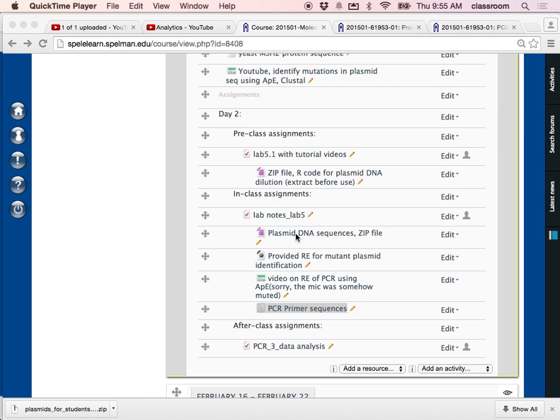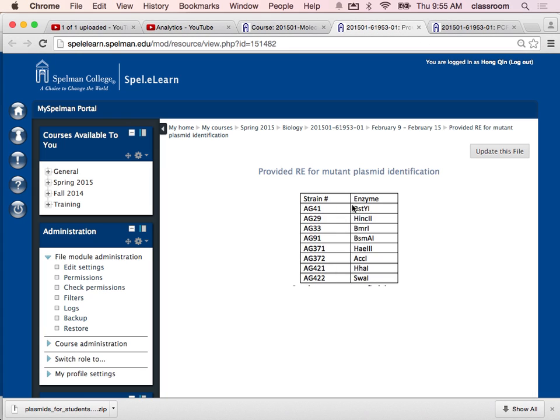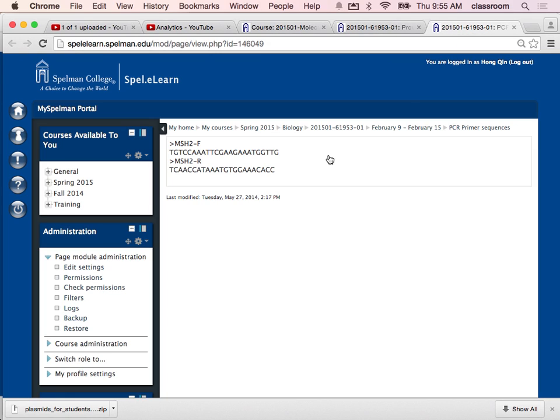The zipped plasmid DNA and the wild type sequence are listed right underneath the assignment. After downloading the sequence you need to extract all the sequences before you can use them. Your enzyme for each group is also listed in a file, and the primers — forward and backward — are listed there as well.